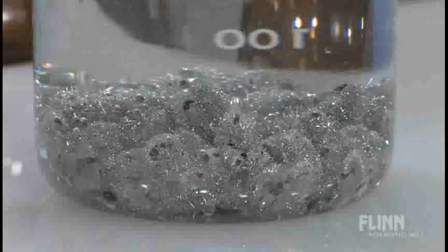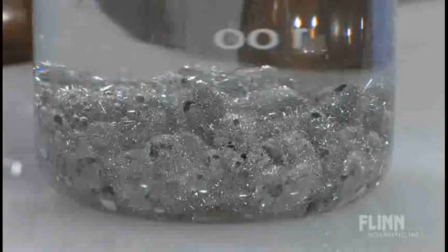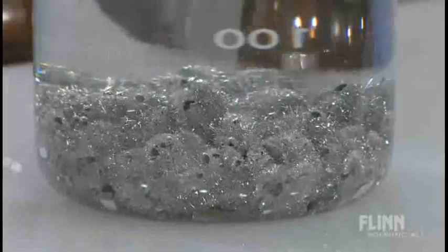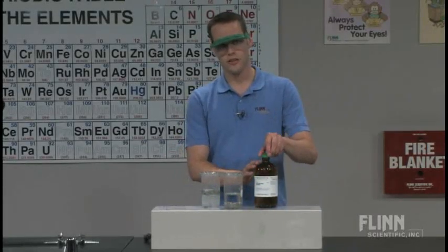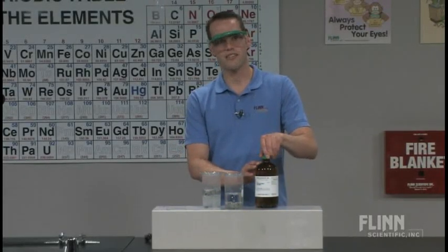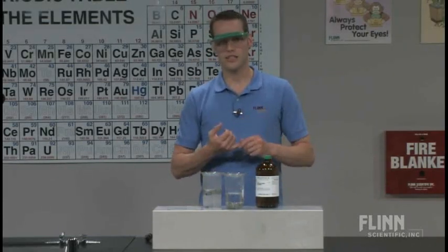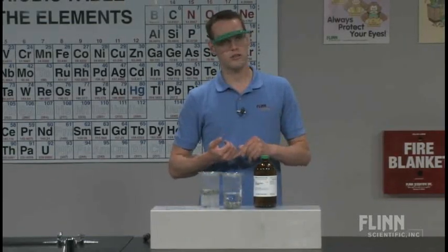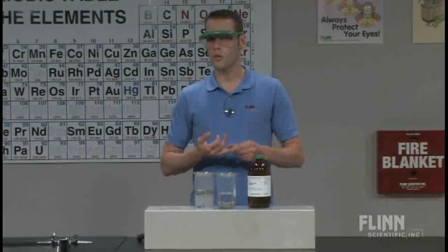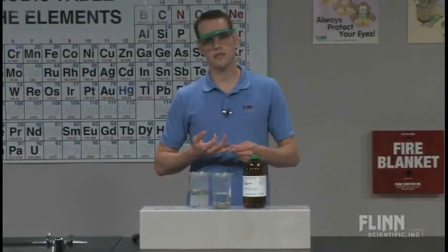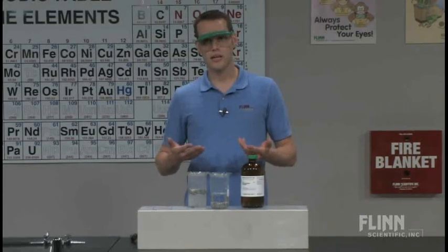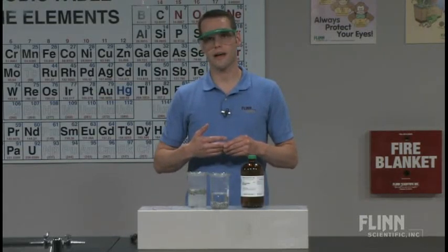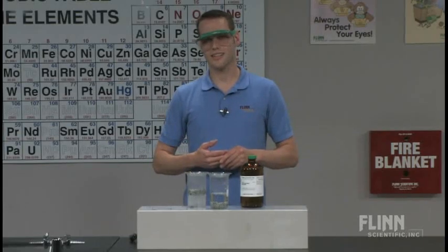The pre-mix solution that Flynn does is from very fresh chemicals and once in solution it's fairly stable. And when you make your solution you want to store it in one of the dark amber bottles to keep the UV away and minimize any oxide formation. But it really is a beautiful oxidation reduction example you can use to introduce the activity series of metals or one you can use to quiz your students on the activity series of metals or when you're talking about your classes of reactions to show two simultaneous single displacement reactions. I hope you find it as useful and exciting as I do.